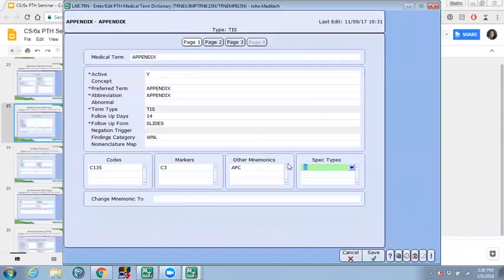And there are different term types that we can define through this dictionary. I will be going through 7 of them, which would be tissues, procedures, QC procedures, diseases, morphologies, and classified and other procedures. The Pathology Medical Term Dictionary is used to define all tissues, procedures, morphologies, diseases, and other pathology medical terms that could be added during pathology requisition or findings entry. This dictionary is also used to allow a quick and efficient way to search for specimens using a coding entry.